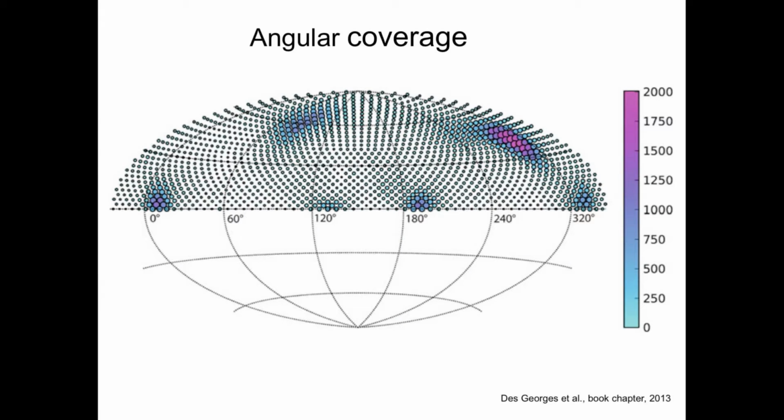This is a program that is now often used in order to show the coverage by projections. You can see that in this case we have a sort of hotspot of coverage with projections in this area and a little bit in this area, but we never go all the way down to 0.